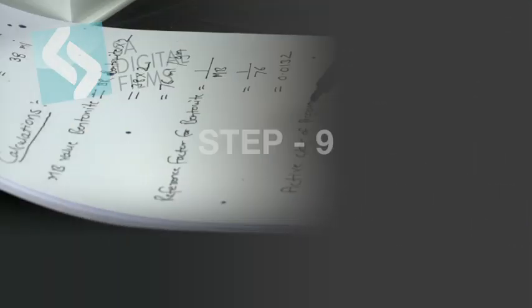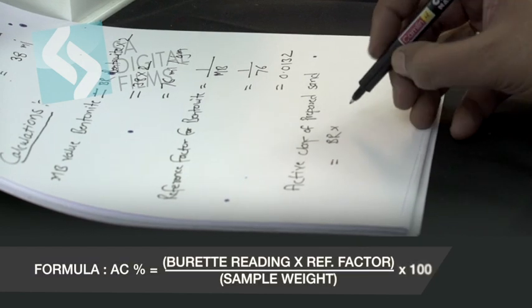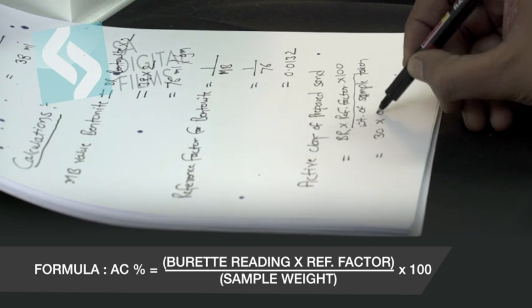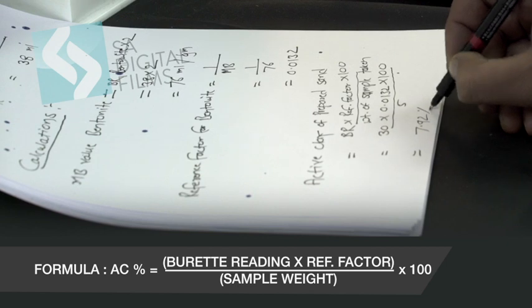Step 9. To calculate active clay content, use the formula: burette reading multiplied by a reference factor, divided by sample weight, the whole multiplied by 100, where RF is equal to reference factor for methylene blue.